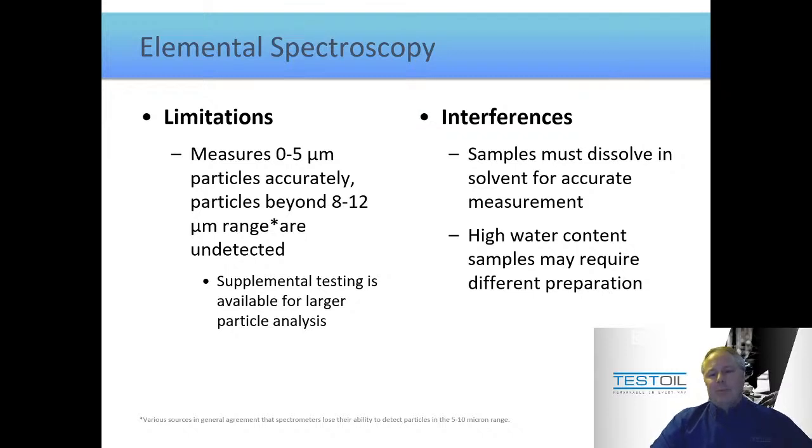It's when things go abnormal, when things get severe, that perhaps this test does not capture everything you're hoping it should. But again, that is the intent of this test, to measure what we expect to find most of the time. Now, a quick comment here about interferences. Sometimes this is why your results don't correlate.